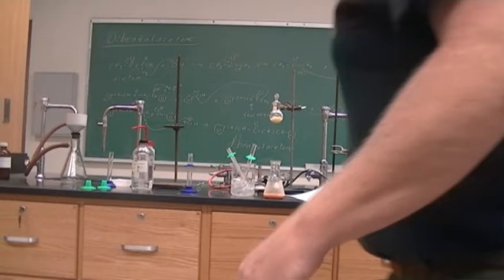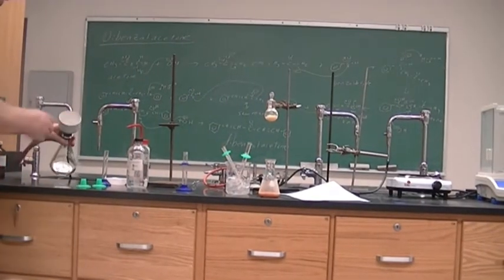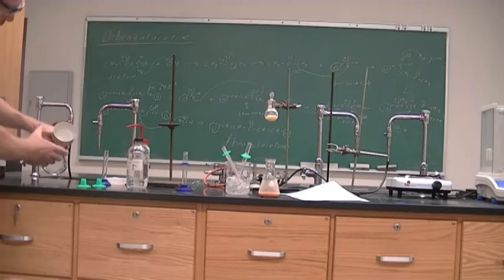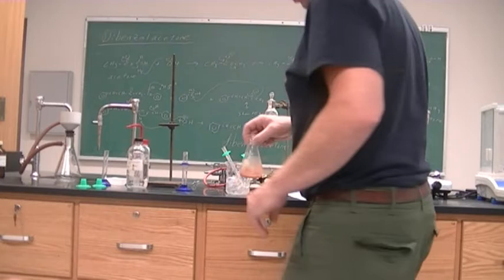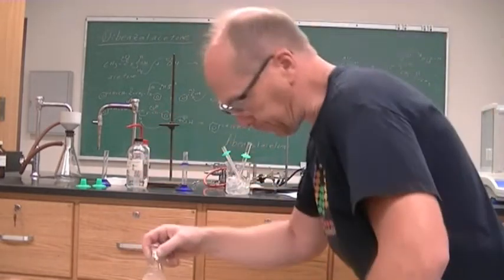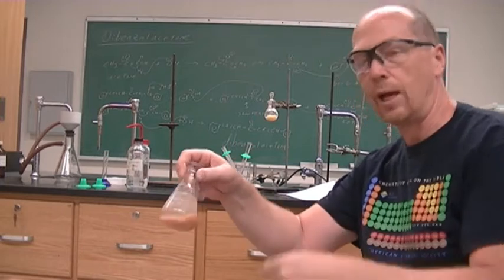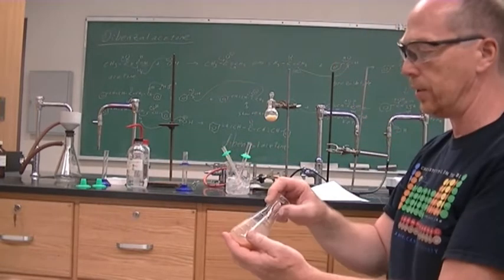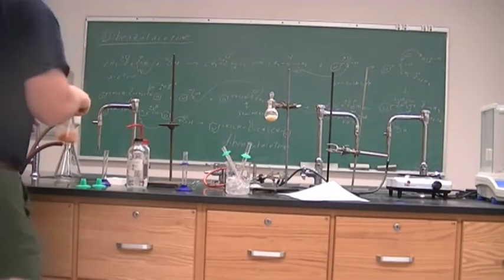Okay. I put a little water on the filter paper, and so it sucked it in, and now it is ready to filter this. So as it says to wash this, the washing is also going to be the rinsing. I'm going to rinse out the flask to try to get all the solid out of here and into the filter paper.